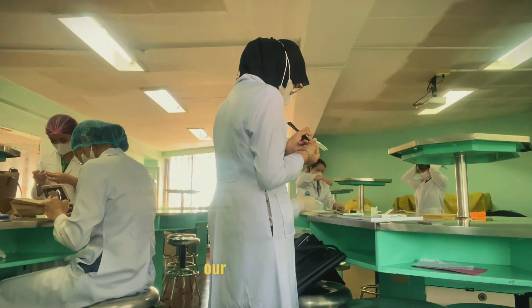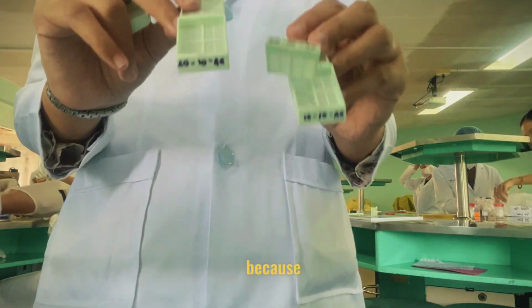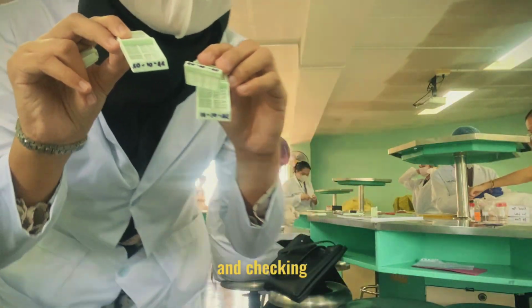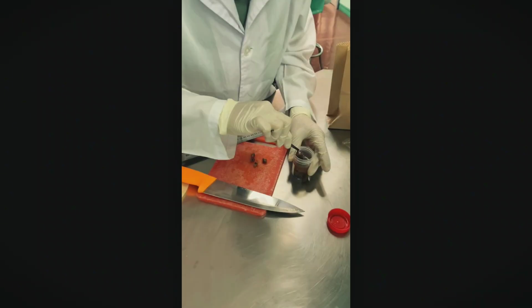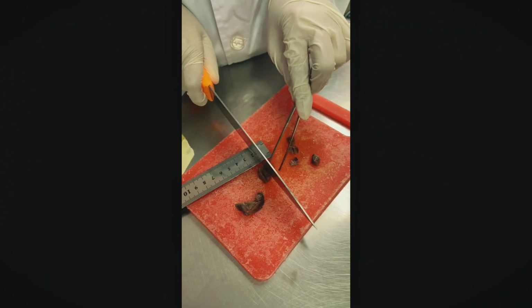First, we need to label our tissue cassettes. Make sure to write down all relevant information because this step is crucial for maintaining proper documentation and checking off the samples. Next, we will perform a gross examination of the tissue.